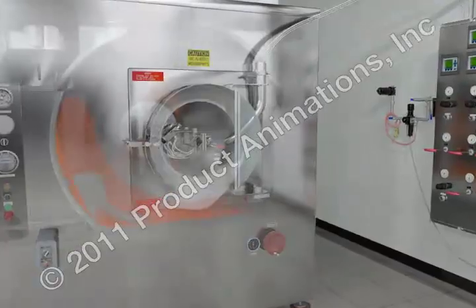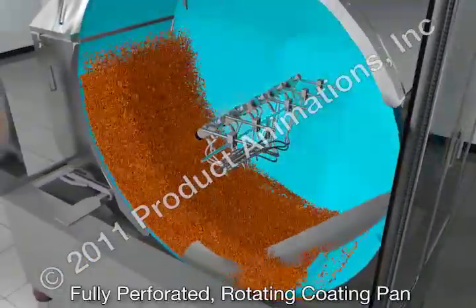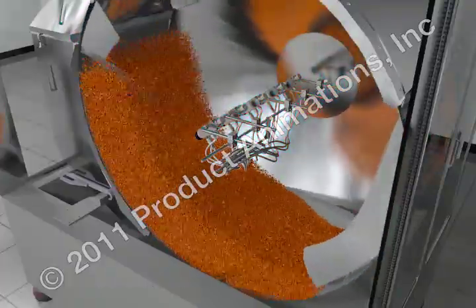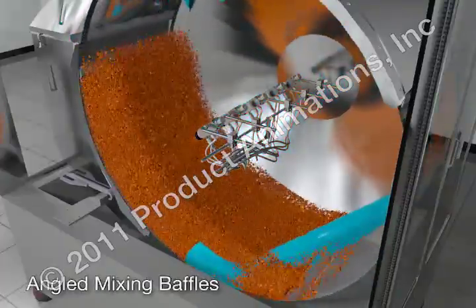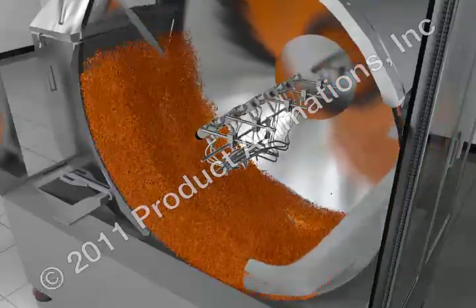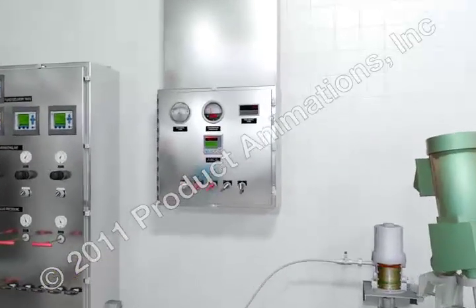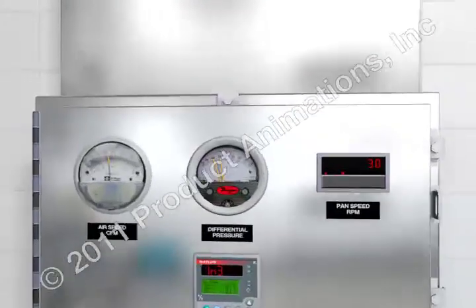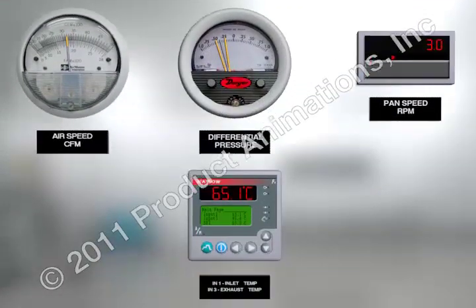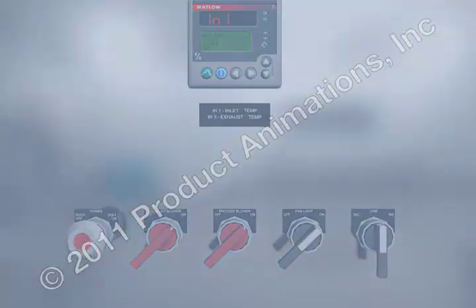Tablet coating takes place in a controlled atmosphere inside a fully perforated rotating coating pan. Angled mixing baffles and airflow inside the drum provide consistent and effective tablet movement for uniform coating. The airflow is regulated for temperature and volume to control drying rates while maintaining a slightly negative drum pressure relative to the room, to isolate the operator from product dust and overspray.